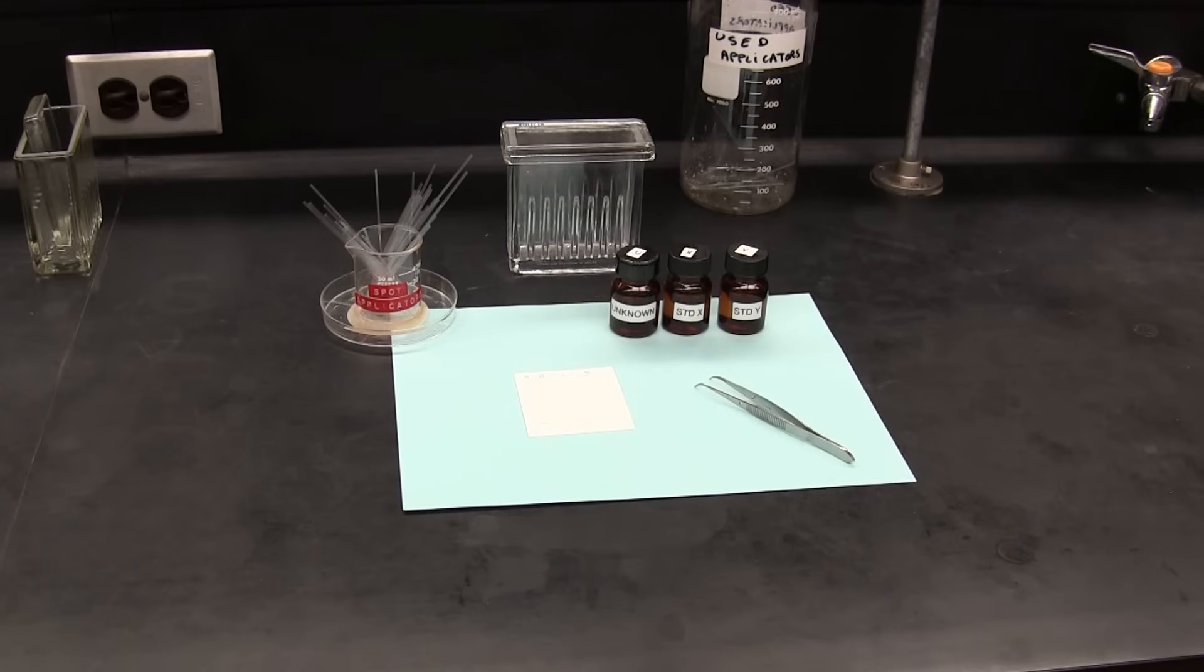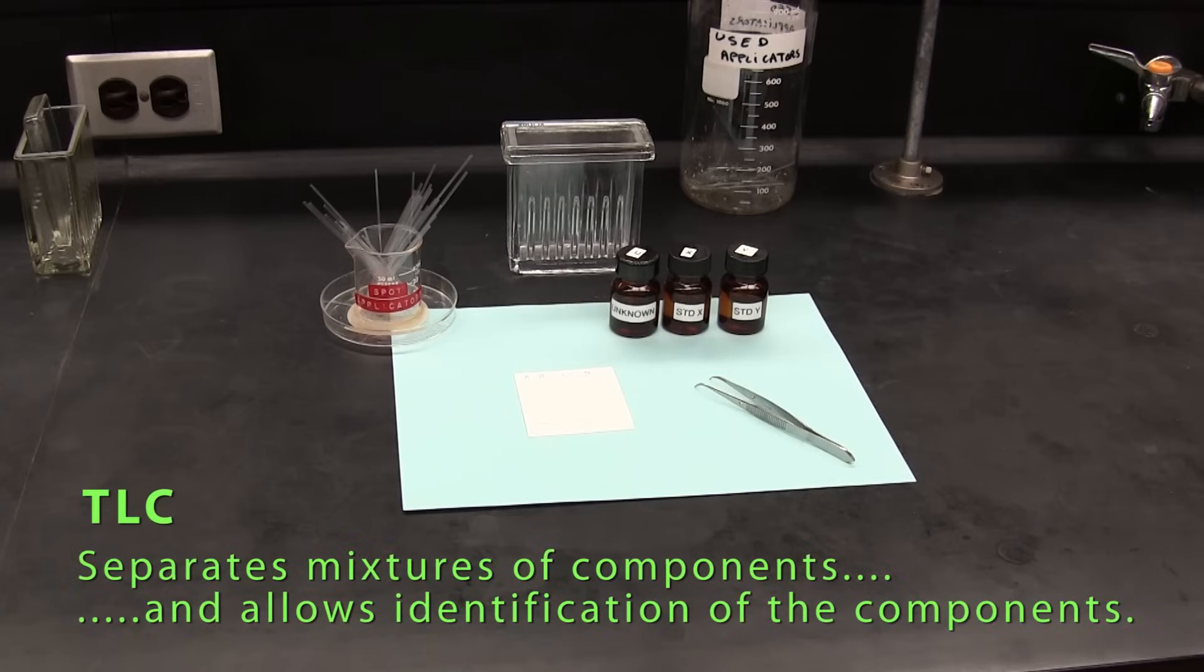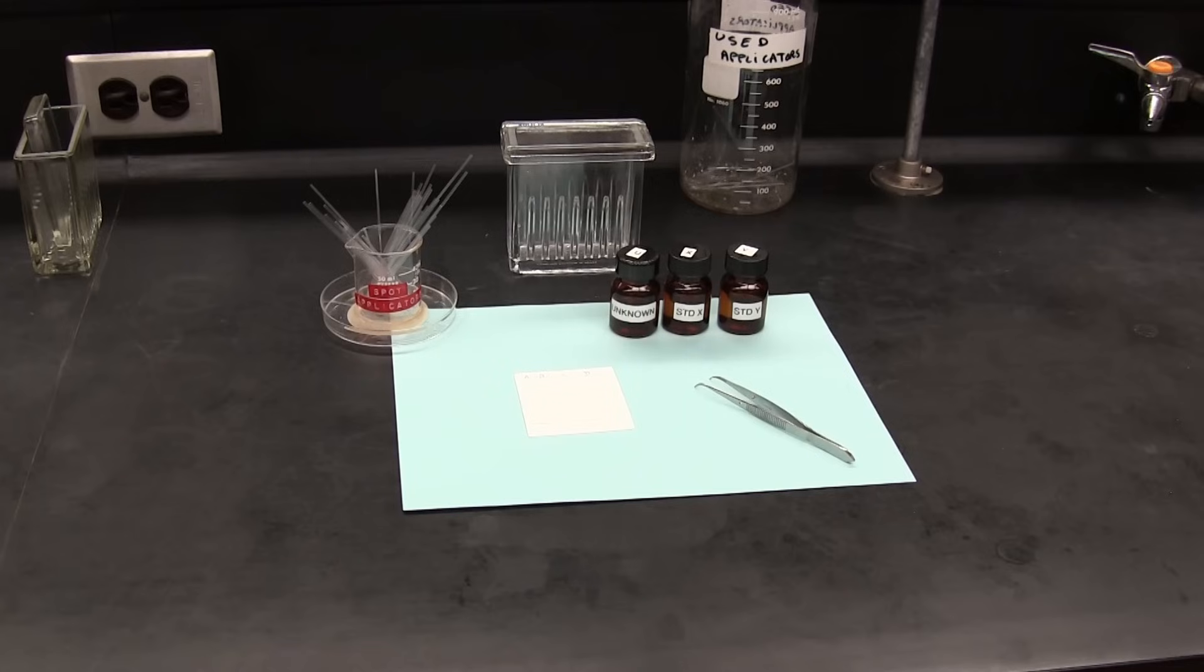Thin layer chromatography, TLC, is a method used for rapid qualitative analysis where components in a mixture can be separated and identified. This video is focused on the general method or procedures used in TLC. For information on the theory, you can check out your lab manual or lab guide.